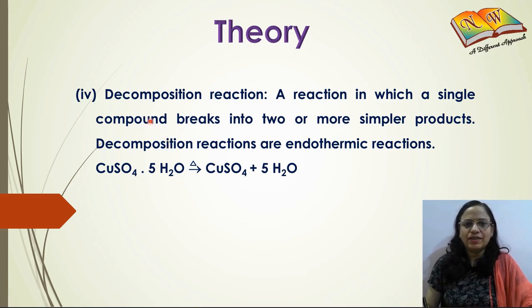The fourth reaction is the decomposition reaction. As the name suggests, decomposition means breaking down. So whenever a reactant breaks up into two or more products, we say it's a decomposition reaction. When we heat crystals of copper sulfate, which are blue in color, the color changes to white because copper sulfate is CuSO4.5H2O, that is, hydrated crystals.